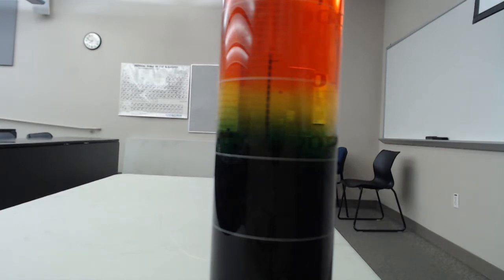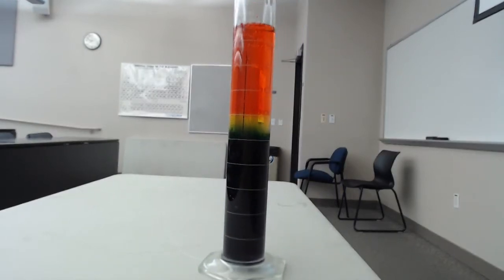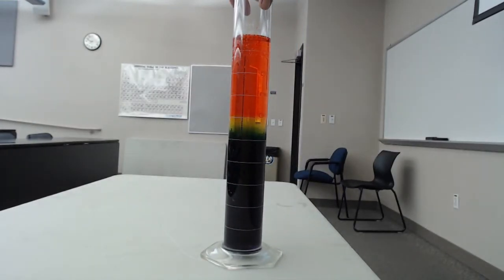I like to call this the pH rainbow. So you essentially get the whole color gradient inside of here. You have a pH gradient and you also have a density gradient in here. And the only reason why we're even able to see it is because of the indicator. If the indicator wasn't in there, it would just be completely clear, colorless solution.